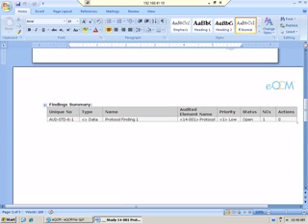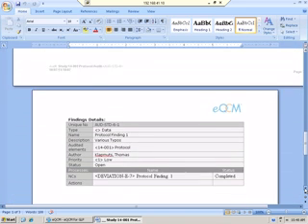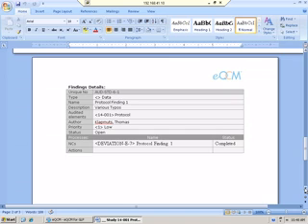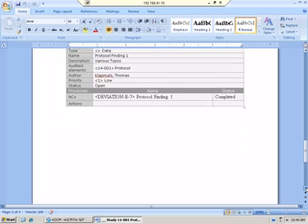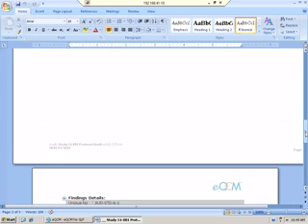So we have the finding number, the type of finding, the name, the audited element, again the linkage, the priority, the status of the finding, whether it was a non-conformance or a CAPA. And then you get into finding details. So the type, the name, description, the non-conformance. So again, everything's linked, so you can now look into your non-conformances and find your deviation. And so that's just some of the items that come out of the audit report.